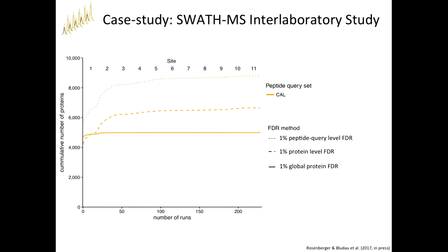I think it just depends on what you need. But yes, you do need to have enough in order to assess your model. We've never done it for less than 100. I would say it does more than that. One of the data sets I'm going to be presenting is actually that TRIC data set when we do hands-on tomorrow, and there I do both the proteome-wide, it's a small proteome, as well as 250, or no, 450, sorry. So I would say 100 to 500 would be fine.